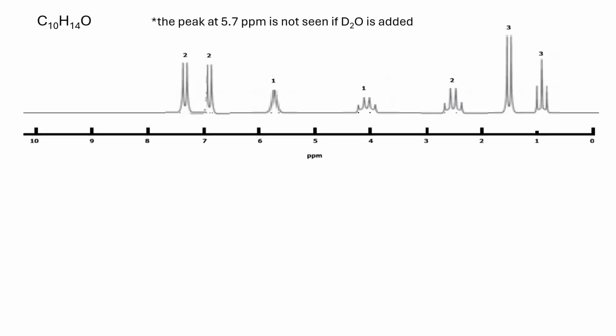Here is the proton spectrum, and the place to look for aromatic peaks, your data sheet will tell you, is around here. In that part of the spectrum, the only other thing that peaks really could be is NHs or OHs, but we know that it can't be those, because apart from anything else, those are split peaks, and remember, NHs and OHs don't split.